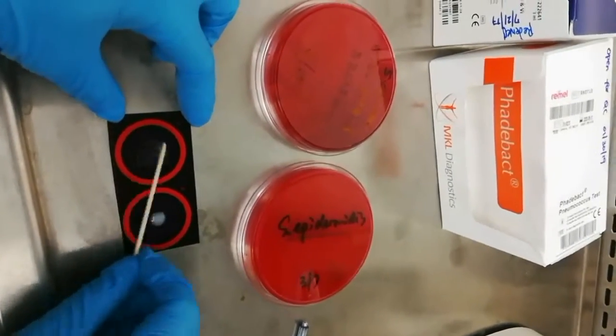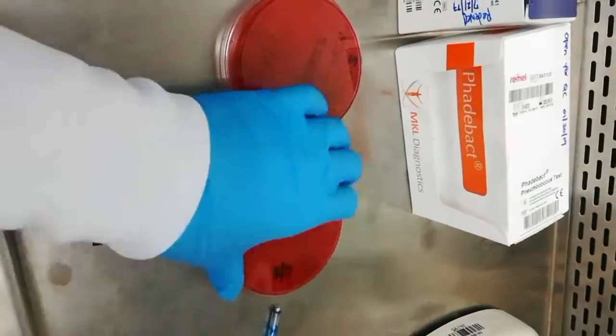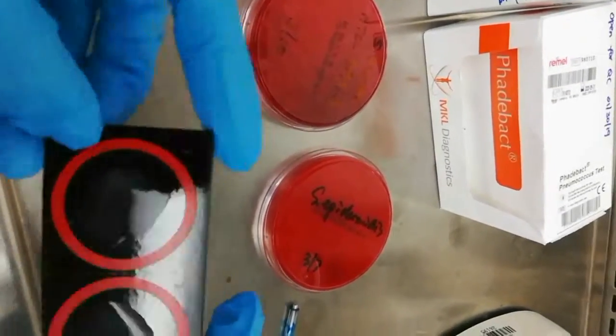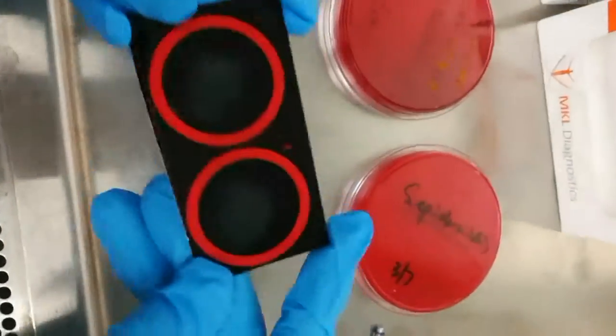So when you have a Gram stain showing gram-positive cocci in clusters, you should be able to perform the catalase test and coagulase test. Catalase is always positive for Staphylococcus species, and coagulase test is always positive for Staph aureus.